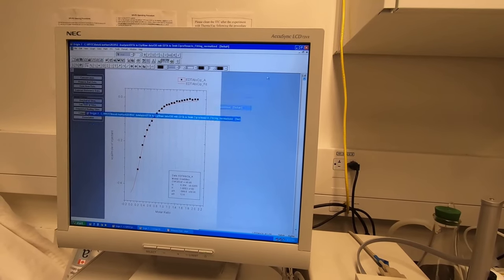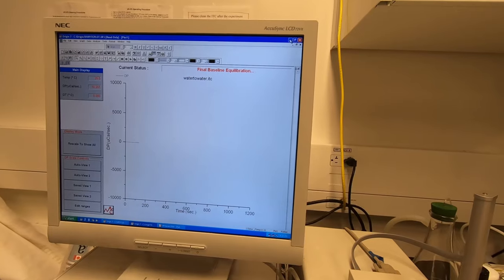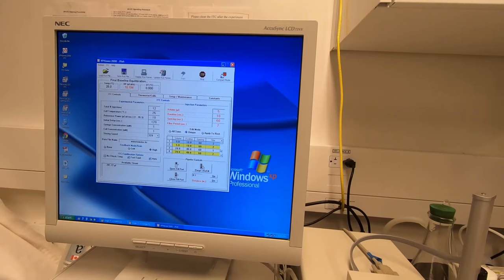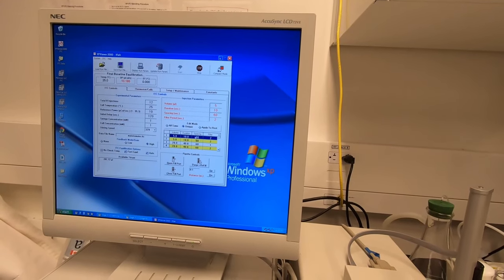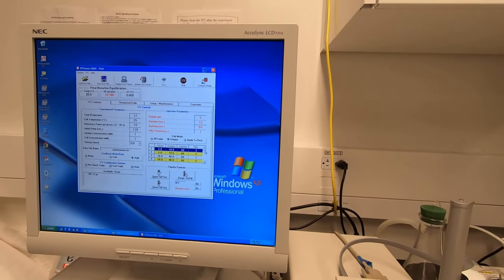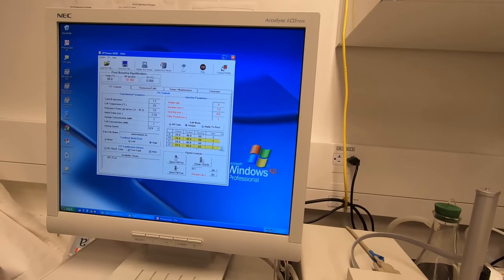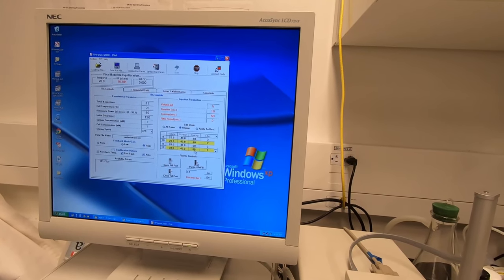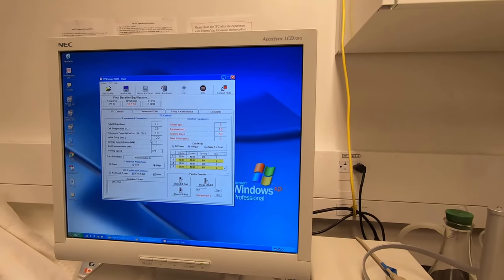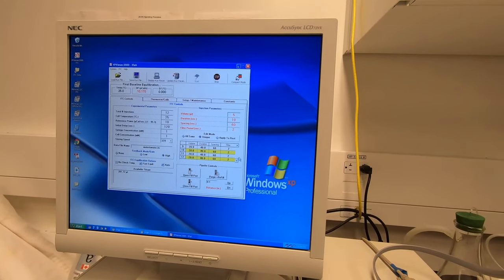Basically that's all for the experiment. You can calculate how much time you need — for example, in this case we have 12 titrations each for one minute, plus the initial delay of two minutes, which is about 14 minutes total. Sometimes it will be a little longer like 15 or 16 minutes, depending on equilibration time before the titration starts.